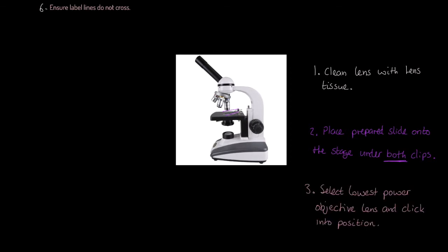Thirdly, we're going to select the lowest power objective lens and click that into position. Because it's the lowest power, it's likely to be the four times magnification lens that you're going to use first.